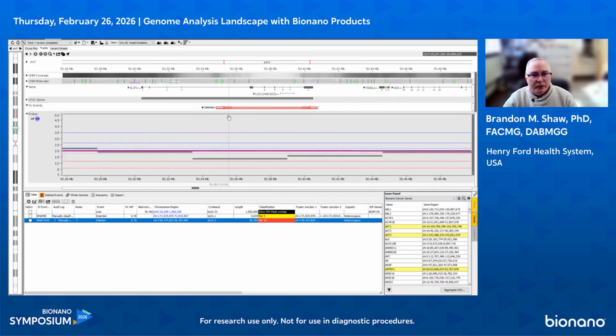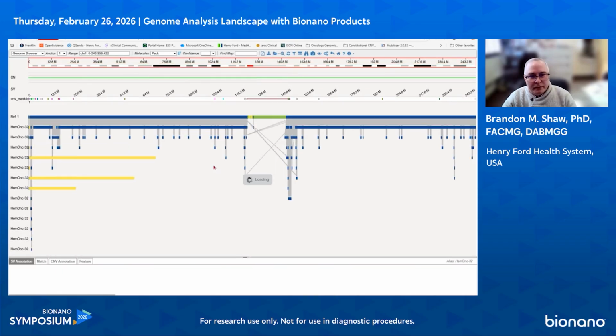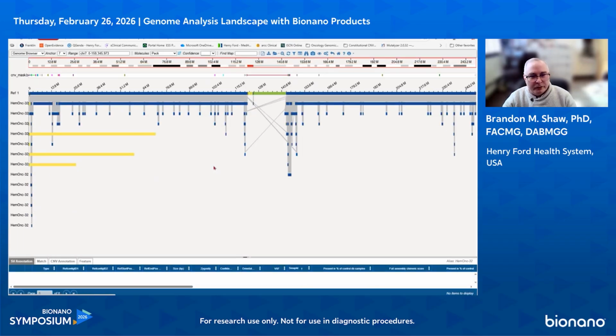One other thing that I would like to add is that for my Access people, because I am not really one of those, but because I've been doing analysis in VIA for a long time with microarrays and now incorporating OGM, but if you wanted to, you could link out to Access and go into browse region and go into Access, and it will open up Access in a separate window, and it will go in and open up this particular variant and go straight to the region where it's located at.